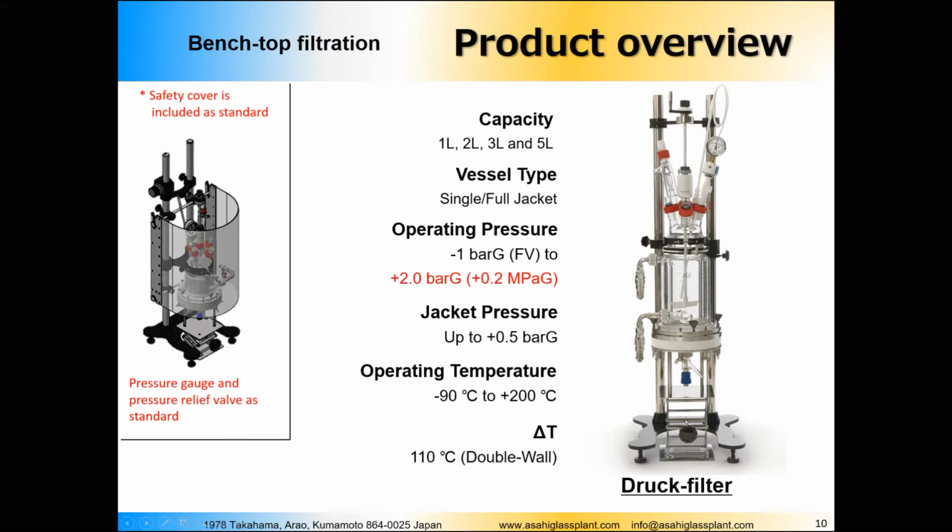It is a spring-loaded thing, so I'm not sure if you can see that, but there is a spring in here and there is a nozzle here. So when the pressure increases up to 2 bars or higher, there is a certain glass part here and the spring is calibrated, so when the overpressure occurs, this glass part slightly rises, releasing the excess of the atmosphere of the gas that we use for pressurizing, and so the gas is released through this small nozzle.